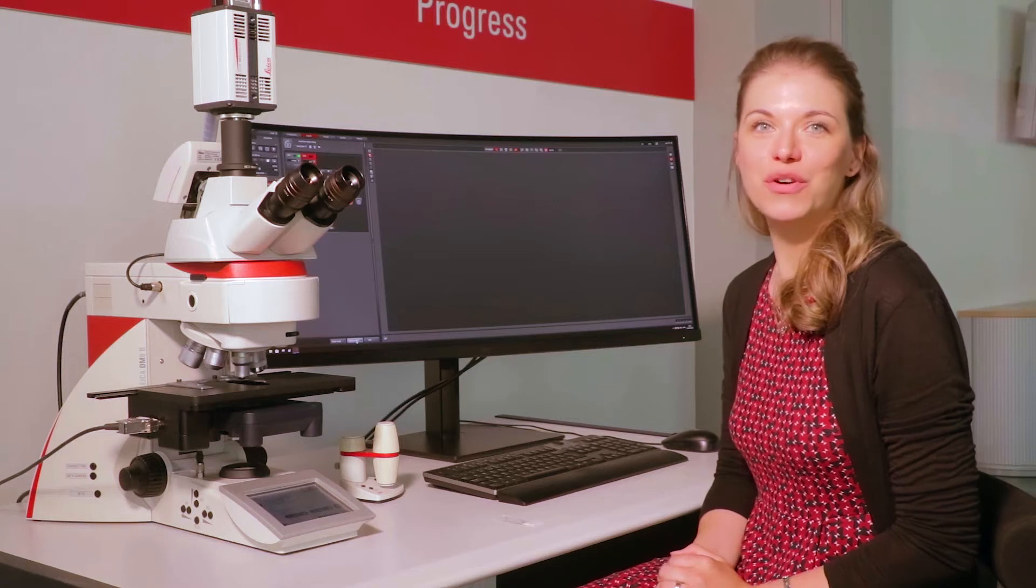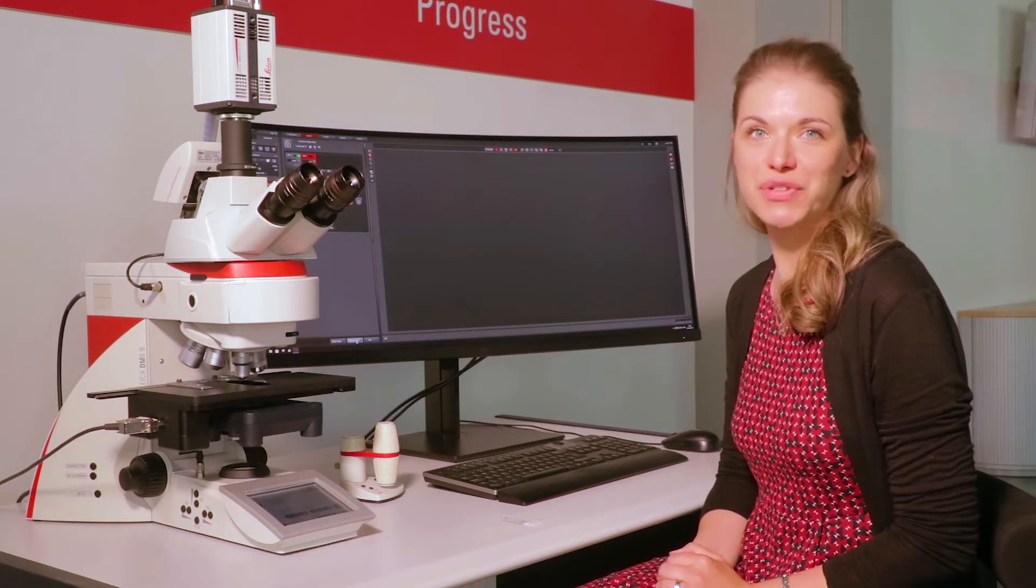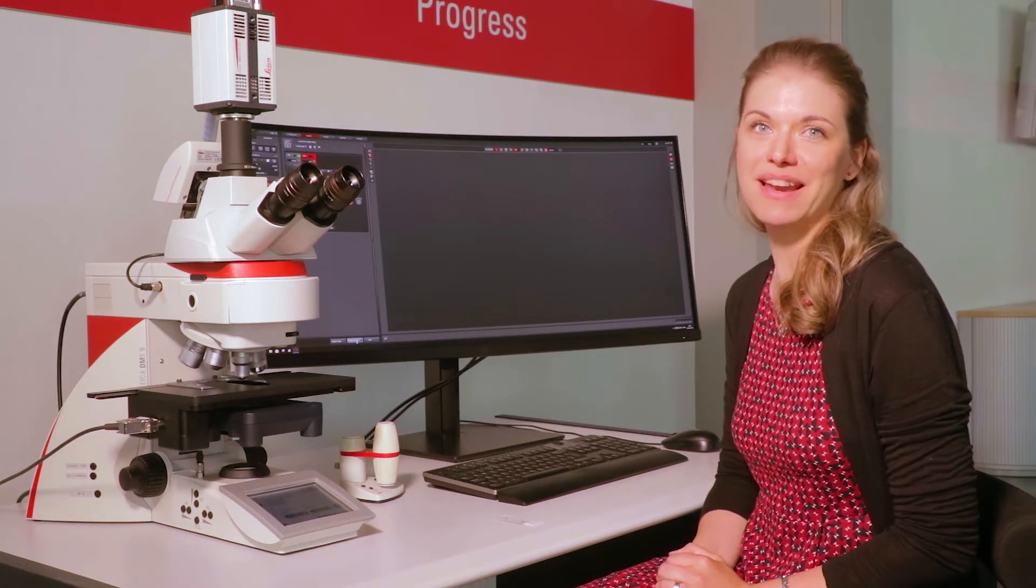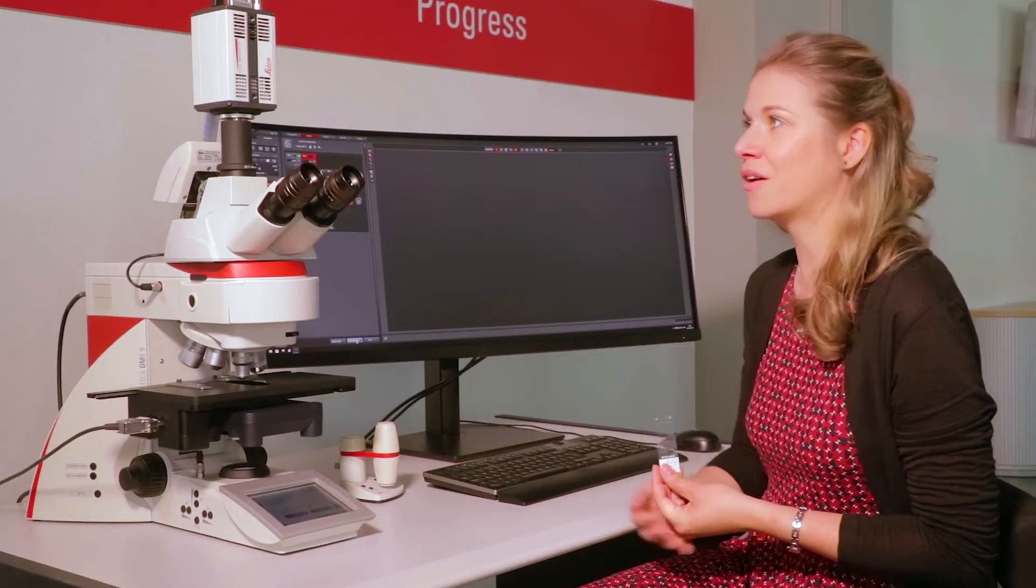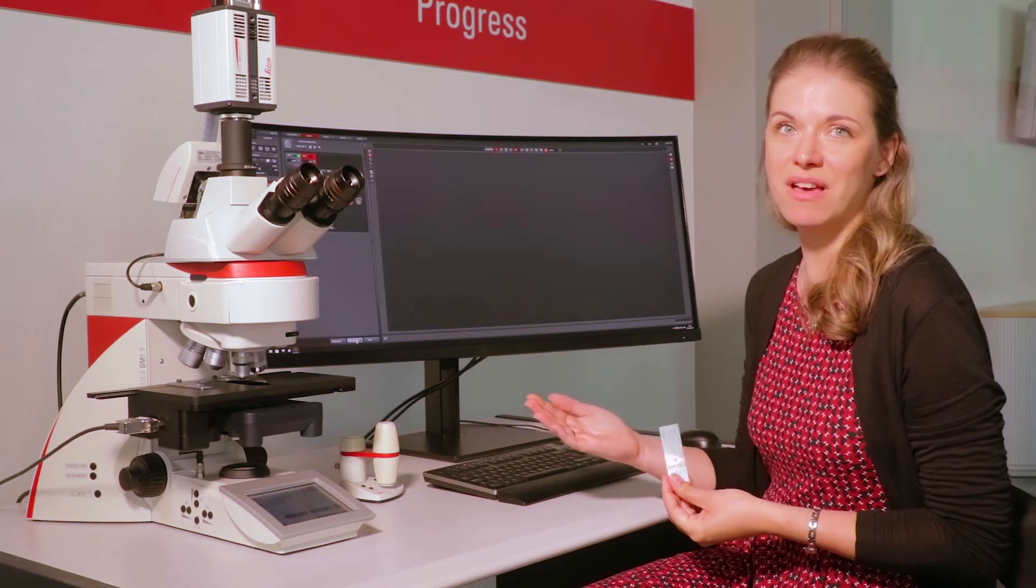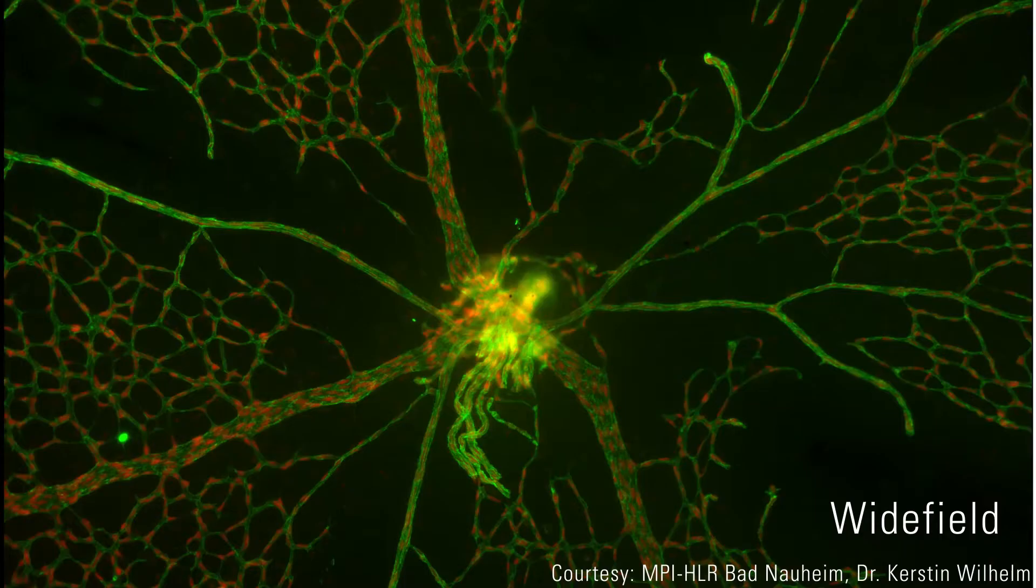Hi, I'm Jennifer Kuhlhai and I'm a Product Manager for Routine Microscopy at Leica Microsystems. Today I would like to show you how we observe retina sections from mice on our new system, a Thunder Imager 3D tissue.